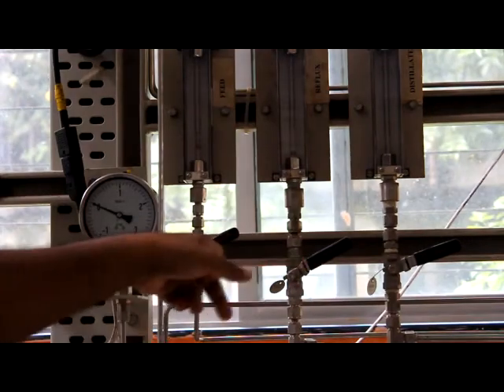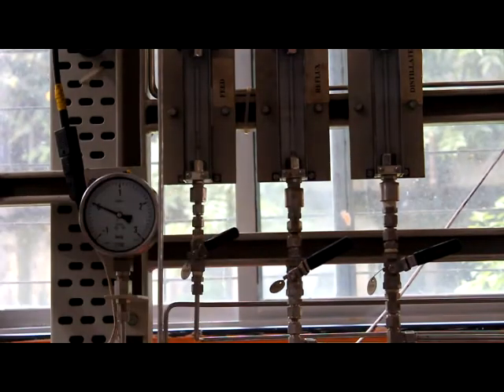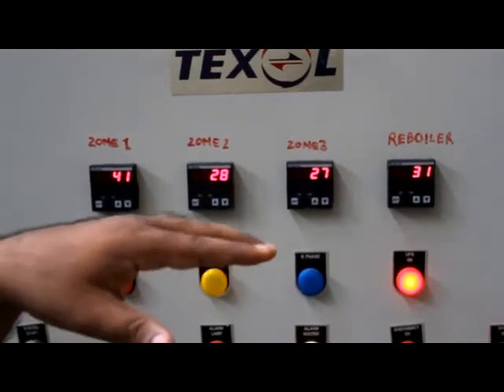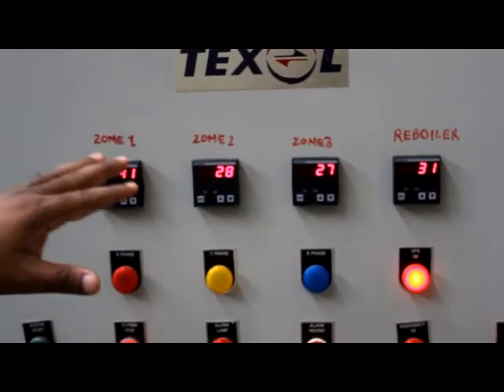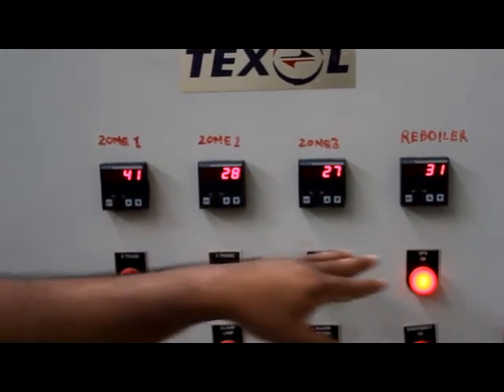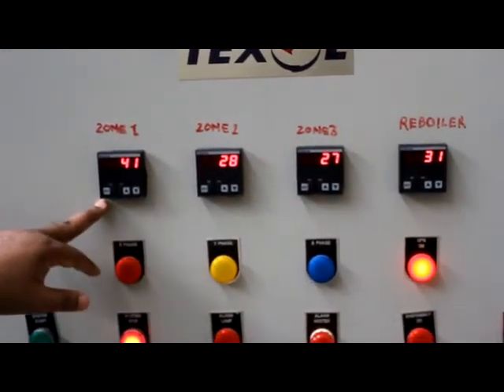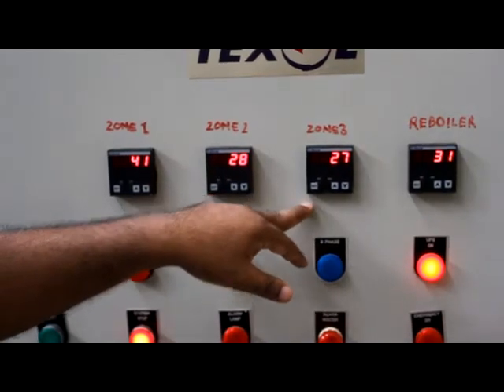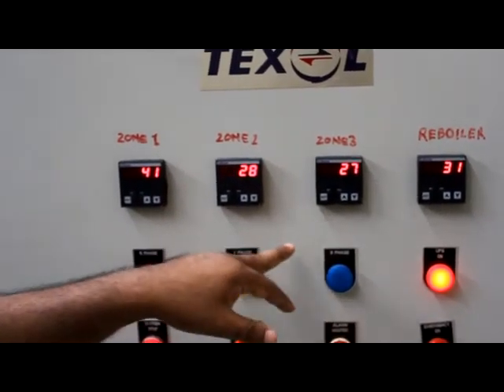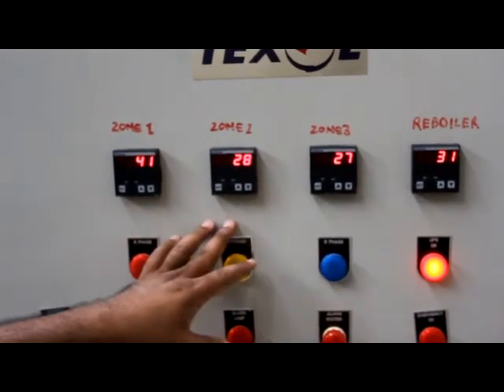So now the column is in continuous mode. Then again you have to wait for steady state to bring in thermodynamic equilibrium. For that you have to watch these temperatures, and they should be constant with respect to time. Once steady state is ensured, your column startup part is over.